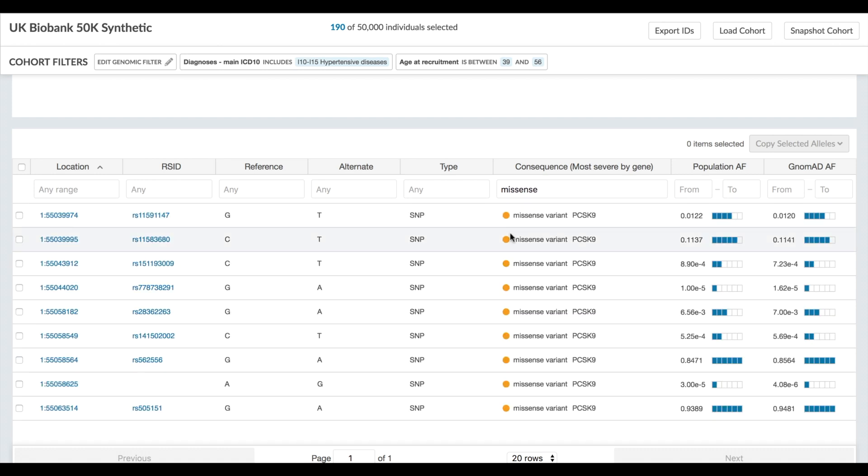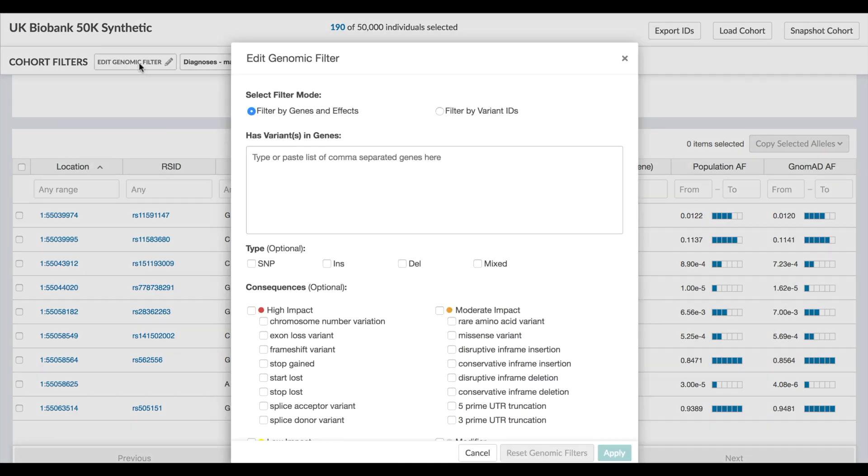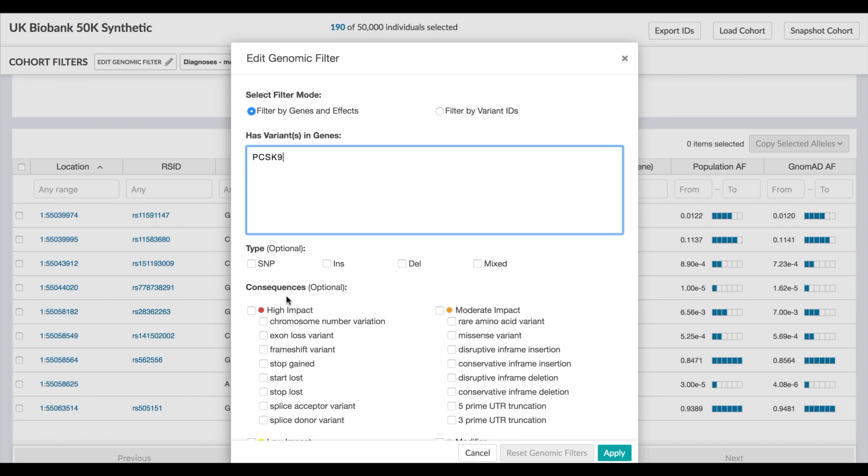If you've found something interesting in these variants, you can create a genotypic filter for the cohort to restrict it to just the individuals who have variants in PCSK9 that are missense.